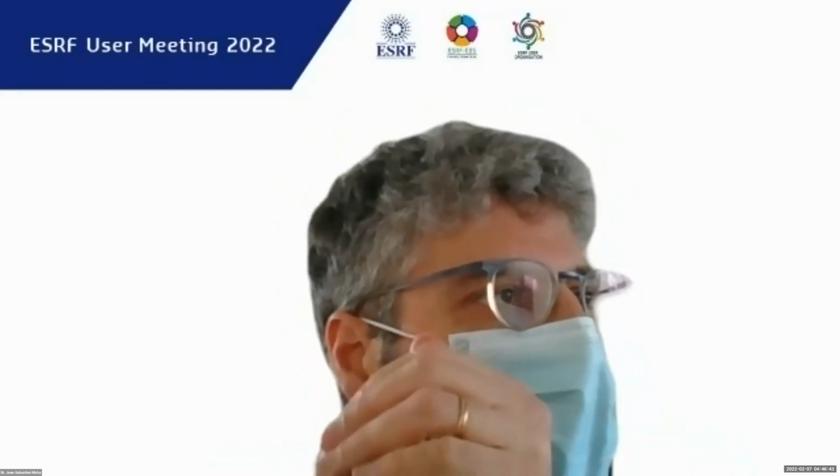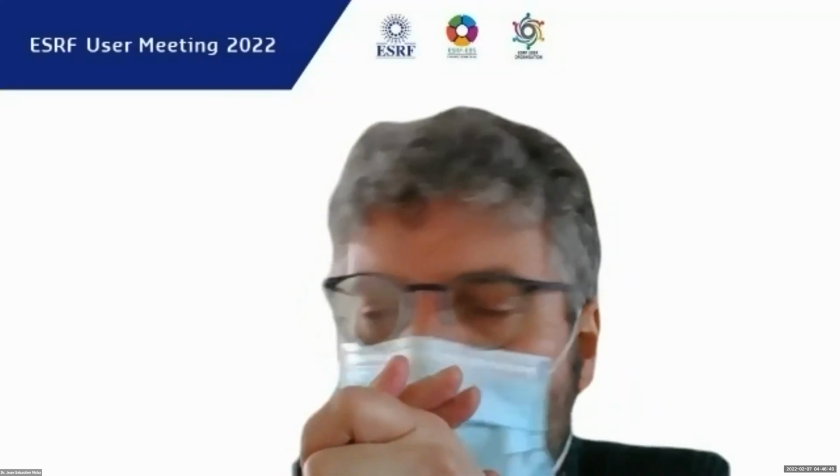I think there was a question relative to the dislocation nature. Ravi told me that you asked whether it is possible to find the nature of a dislocation from the Laue pattern.